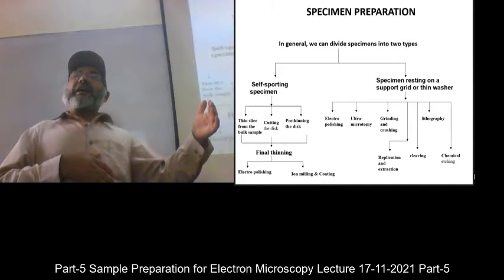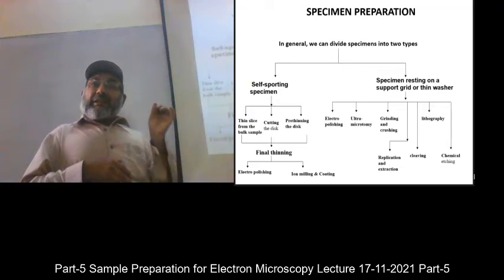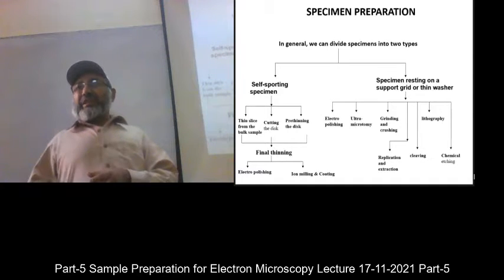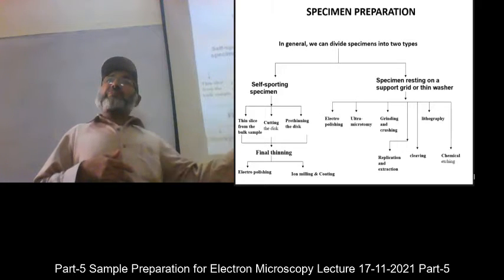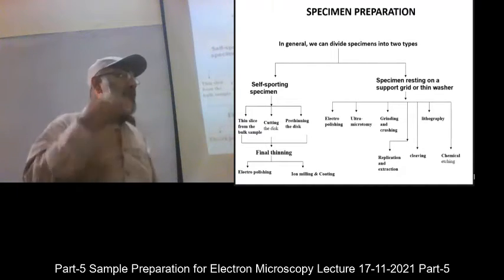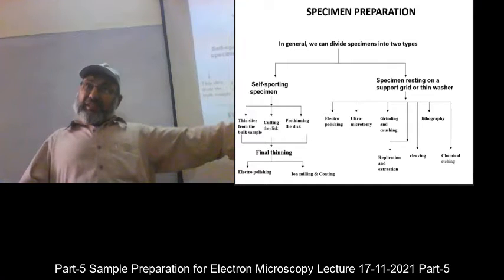Secondly, they are not confining or limiting their study to a specific sample, but the representative study which reflects the reality of this material is that you select samples randomly from different parts of the same material, right?